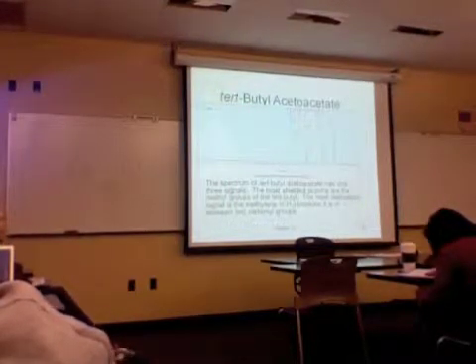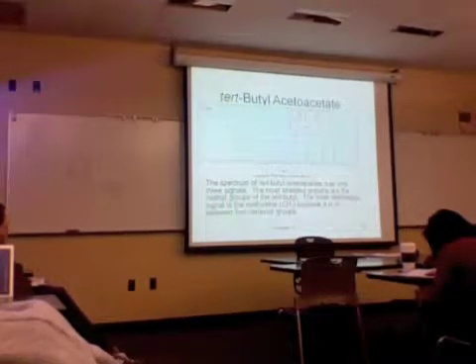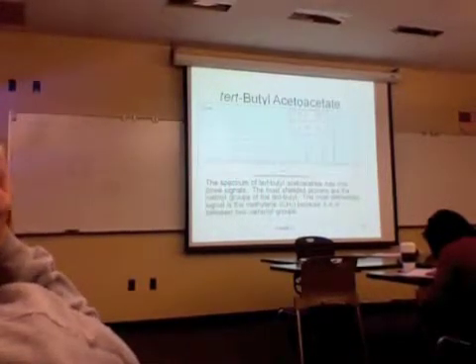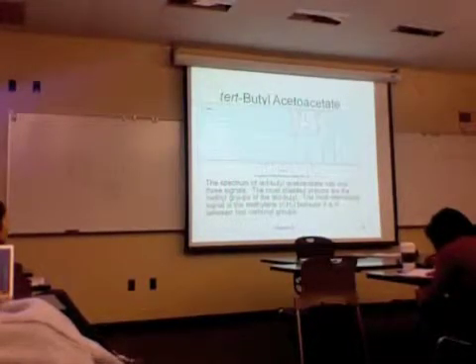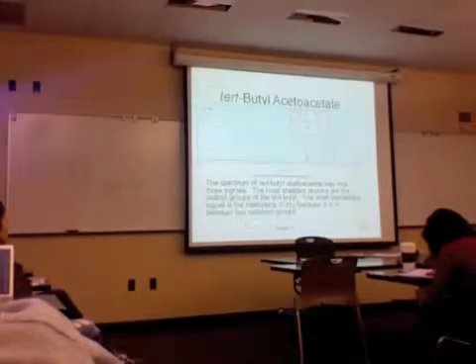Now, we would expect C to be farther downfield for what reason? Here's the C hydrogens. The oxygens. Because they're adjacent to 2 carbonyl groups that are polar. Does that make sense? Whereas these 3 are adjacent to 1, so it's not as far downfield. These are fairly removed. There is this oxygen right here, but these guys are a couple of bonds away from that. So they're a little bit downfield, but not very much. Does that make sense? And in the end, when you're using NMR to rationalize a structure, it ought to be consistent from this kind of analysis perspective.